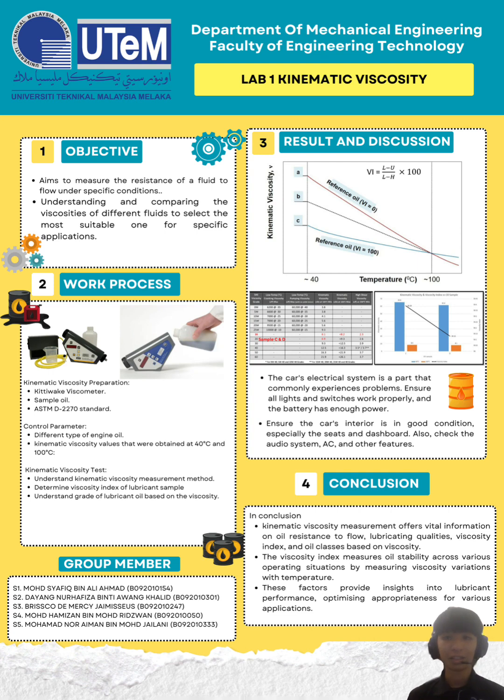In other words, in the kinematic viscosity experiment, the measurement provides crucial information about an oil's resistance to flow under specific conditions, aiding in the assessment of its lubricating properties, determination of viscosity index, and oil grades based on viscosity.